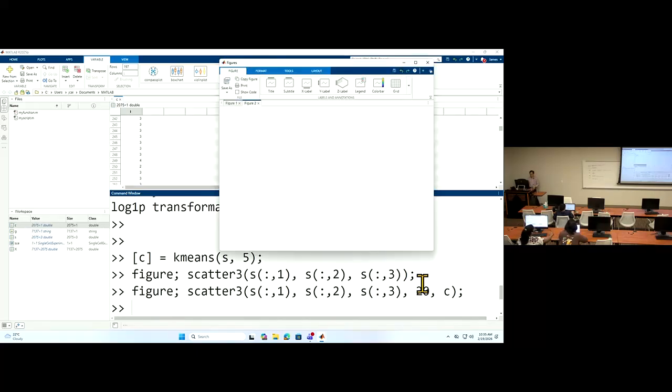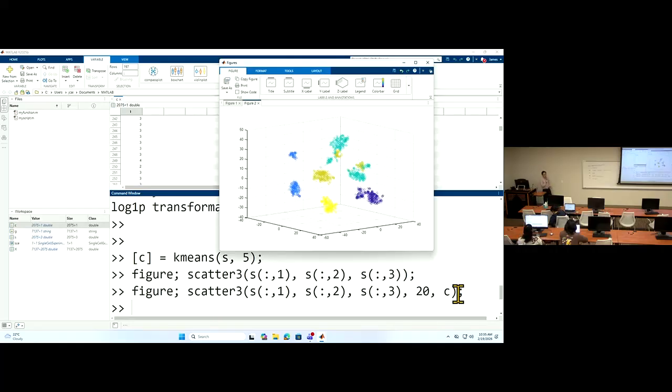If I do this to give the information C, each cell will be given a tag. So this belongs to group 1, 2, and this function will color it differently depending on the membership of the cell. Is that okay, everybody?